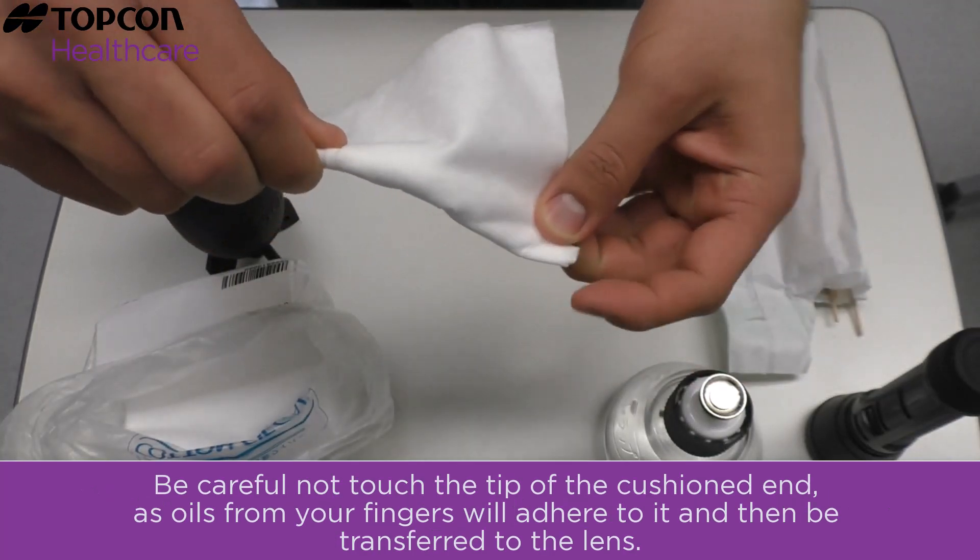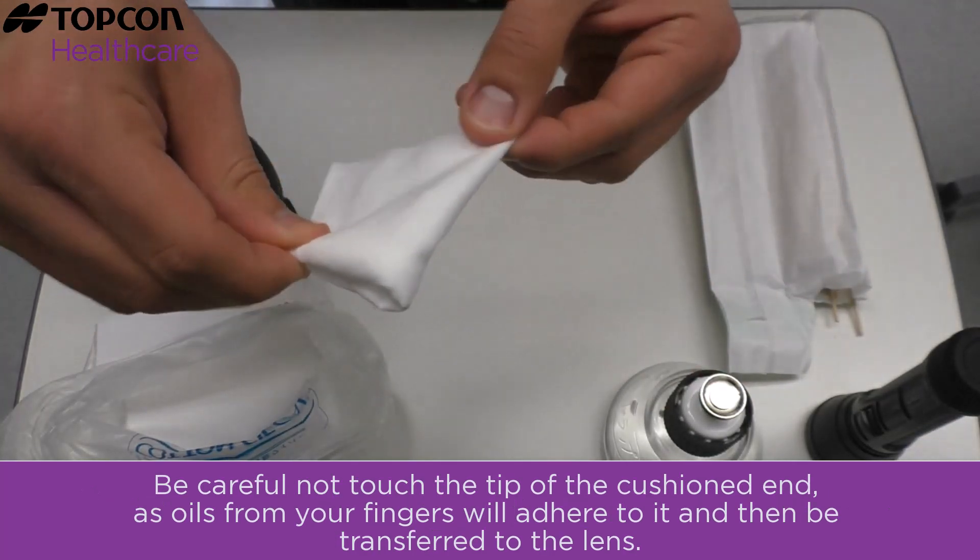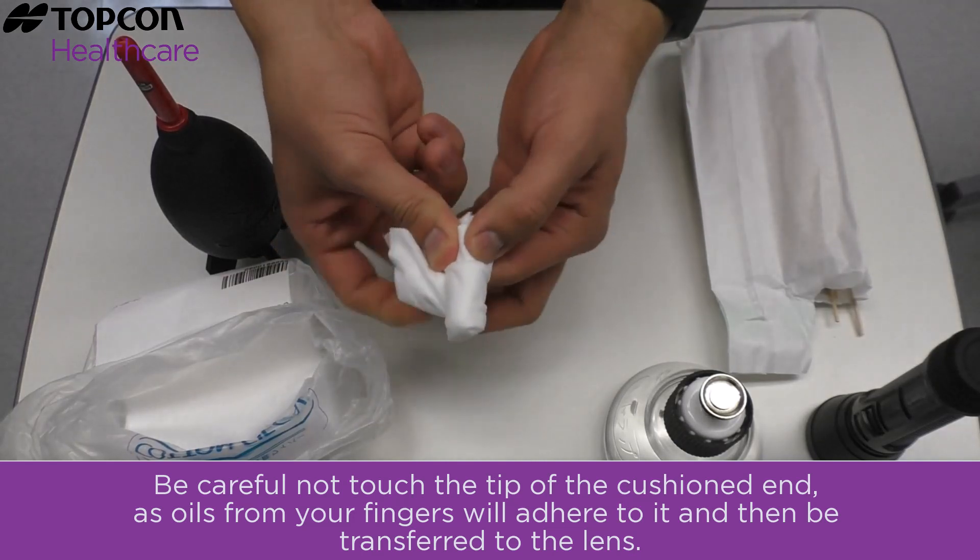Be careful not to touch the tip of the cushioned end, as oil from your fingers will adhere to it and then be transferred to the lens.